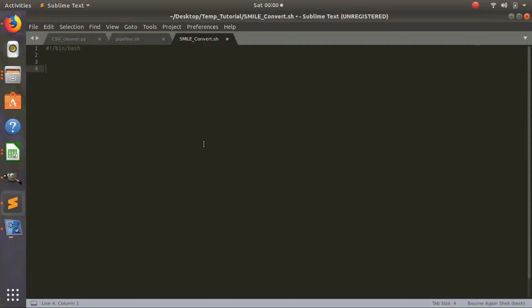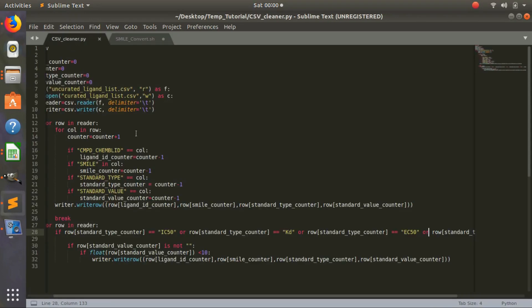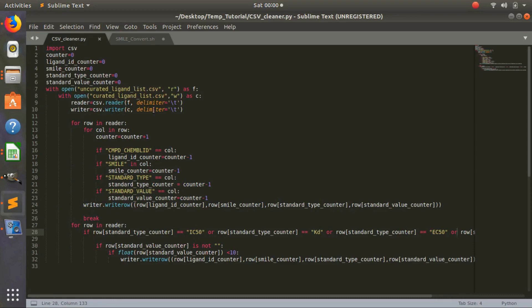Hey guys, it's Richard with part 2 of the video on how to create your in silico drug discovery pipeline. In the last video we cleaned up our CSV file that we got from the ChemBL database. Now we want to start building our pipeline and move to the next step.